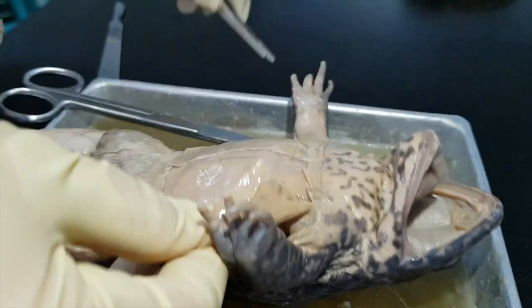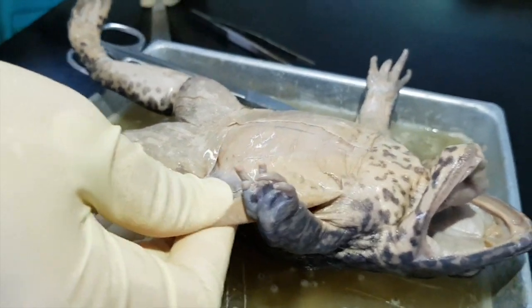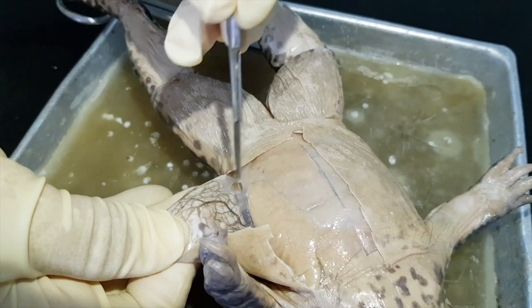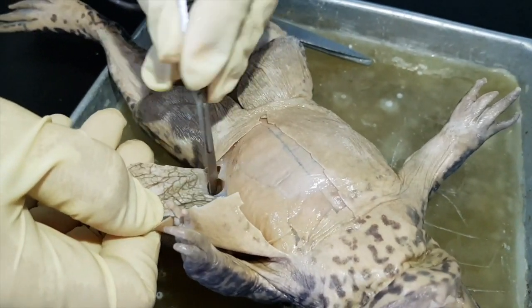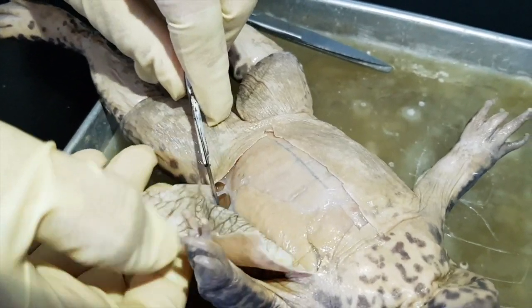What you're going to do is remove it slowly, and take note that there is some fascia that attaches the rest of the integument with the underlying muscle. So you can just remove it slowly, not to damage the muscles.